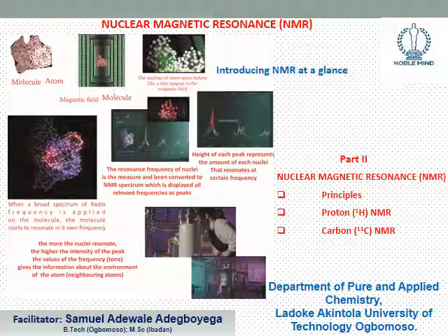and if time permits us, we shall be talking about elucidation of structures using NMR or joint elucidation, depending on the time available to carry out this task.